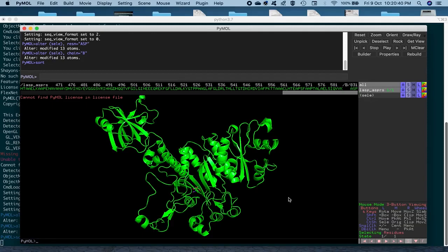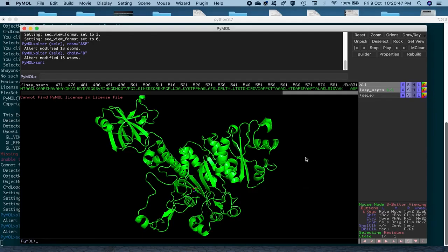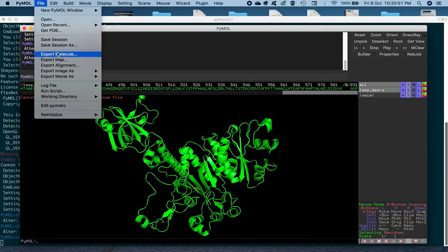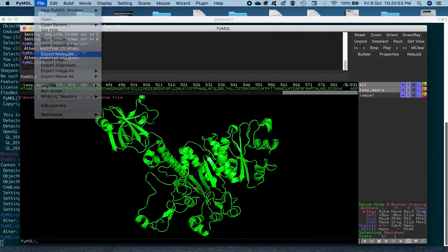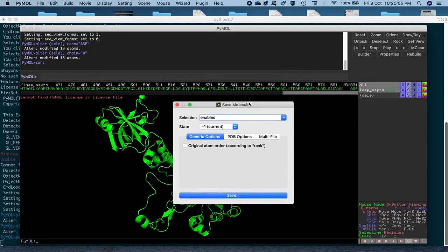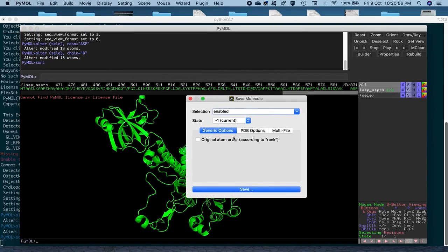So, once you have made these changes in the residue name and the chain IDs, you can go ahead and save this structure as a separate PDB. So, in order to do that, we go to File again, and then Export Molecule, this option. When you click on it, it will give you further options to save the structure.